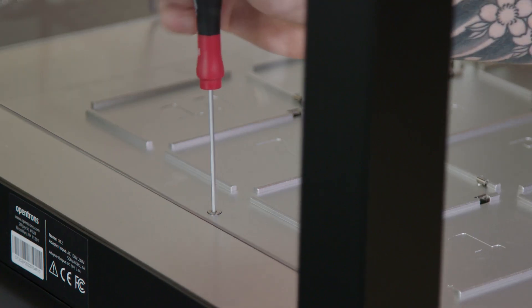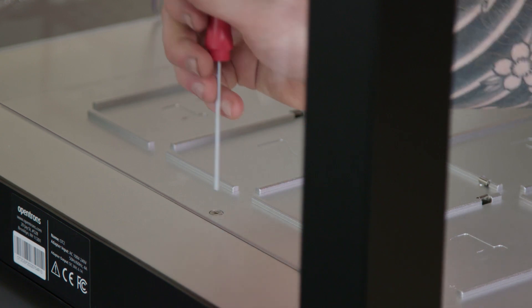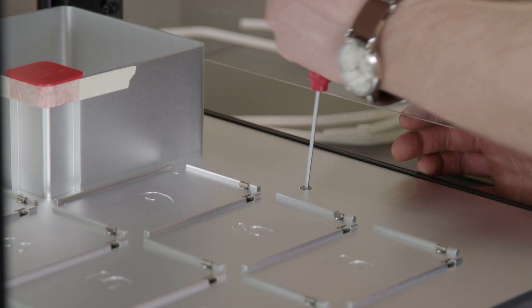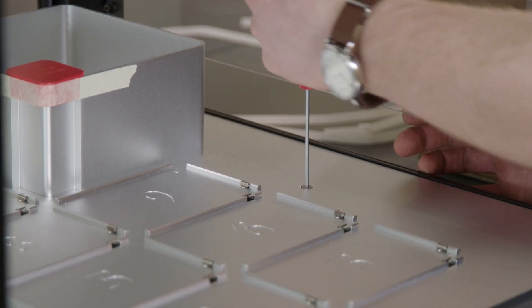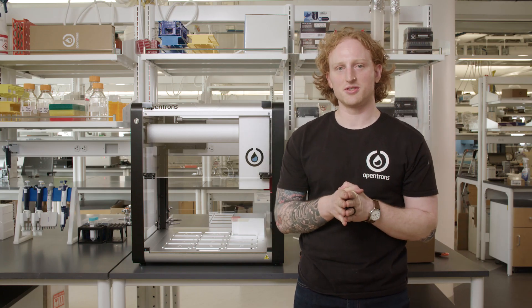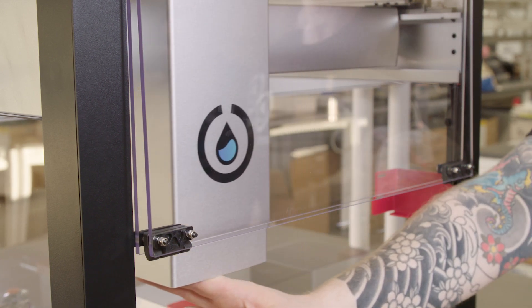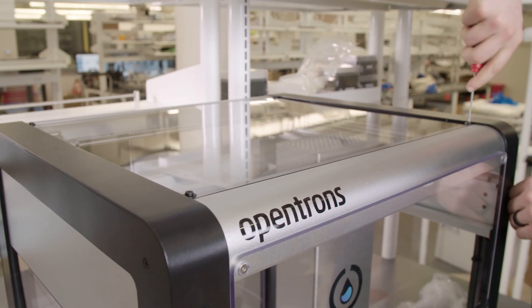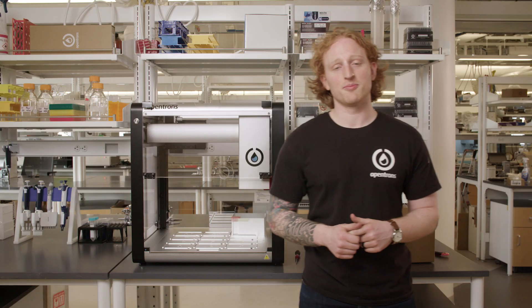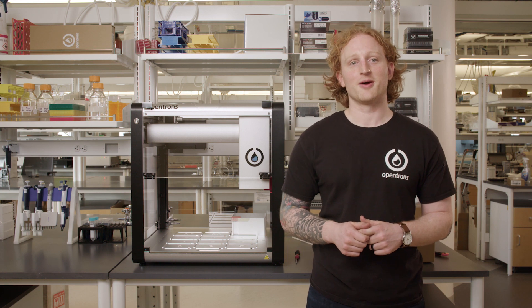And I will now screw in the two screws I just unscrewed. So that's it for unboxing the OT2. Thanks for checking out the first video in the series, From Box to Protocol. Next, I will continue with the setup of the OT2, which includes unlocking the OT2, setting up the Opentrons app, and calibrating the OT2. Bye for now.